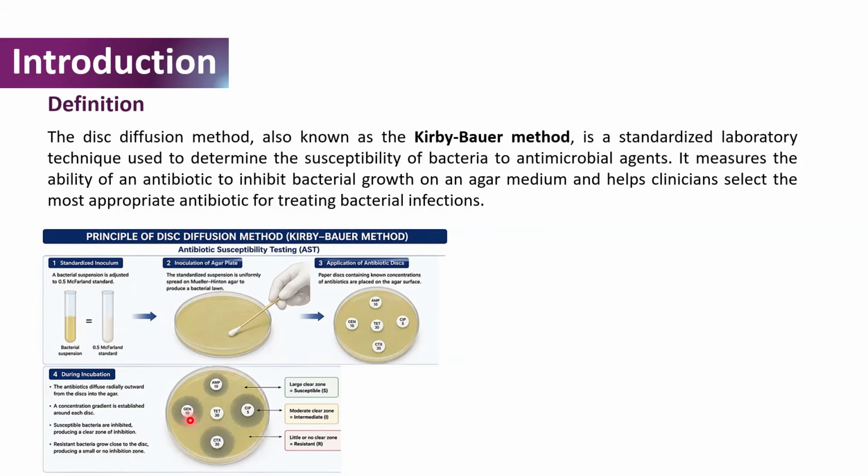As this happens, a concentration gradient is established around each disc, and as a result, susceptible bacteria are inhibited to produce a clear zone of inhibition, as shown over here.